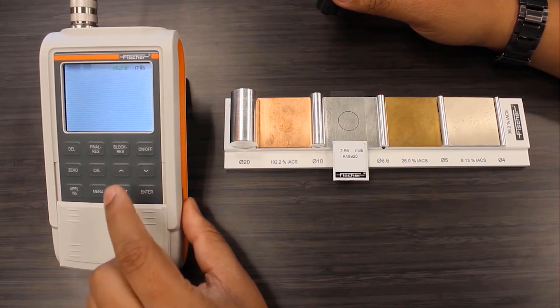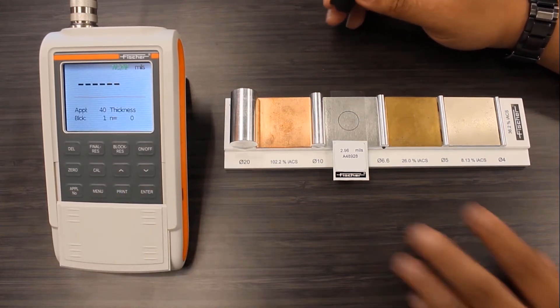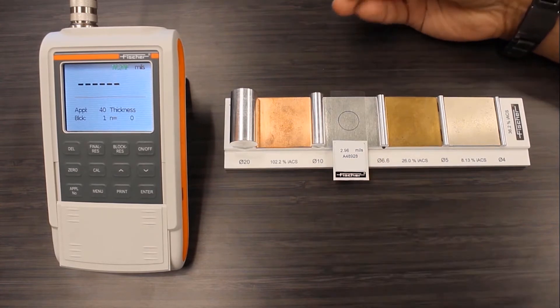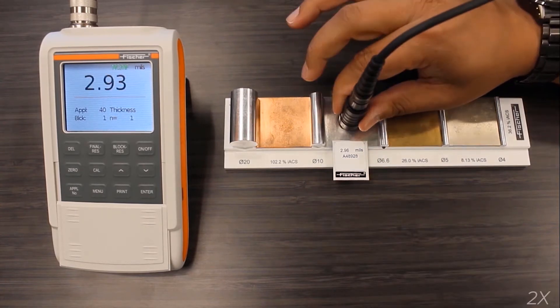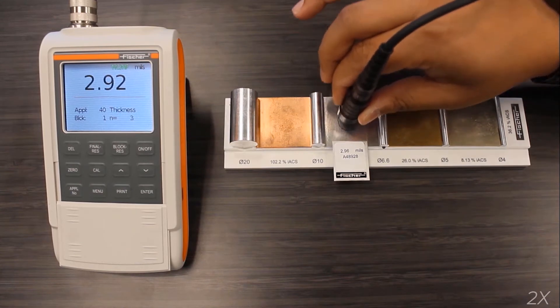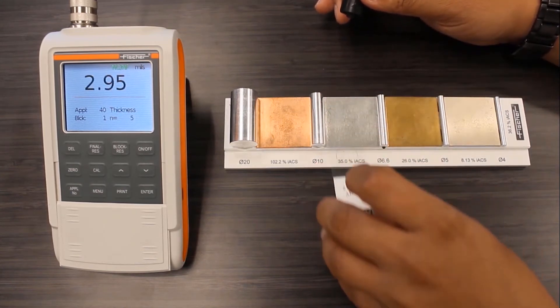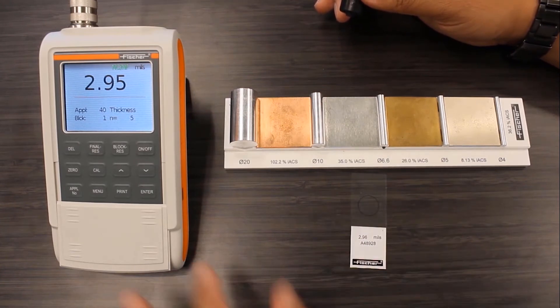Now that the calibration is complete, I'll measure the foil back on the flat substrate to verify that the calibration worked and the instrument is reading correctly. No issues here — the instrument is reading back correctly, and that's to be expected from most gauges.